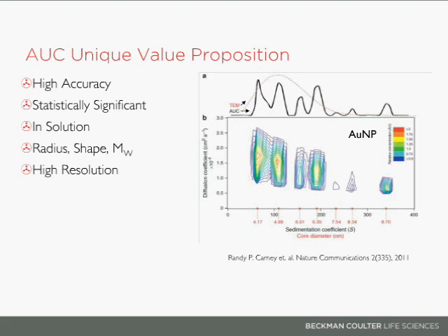So, quick quiz here, just making sure you're paying attention. Which one of the forces listed here is not one that particles feel during centrifugation? If you've been even semi-awake, this one should be pretty easy. So we'll give you about 5 or 10 seconds for this question.